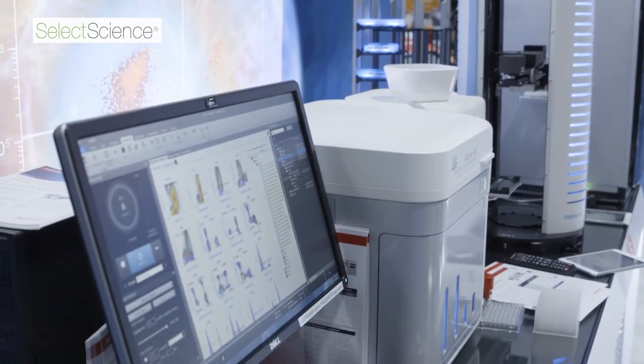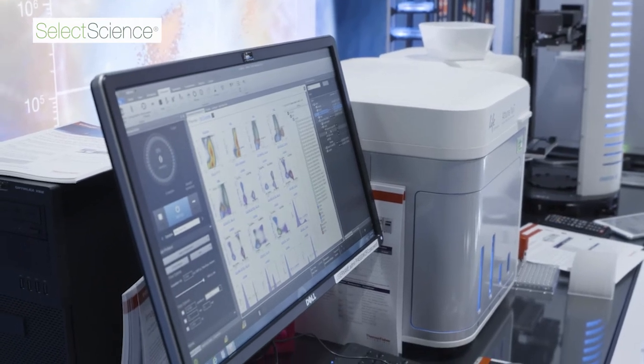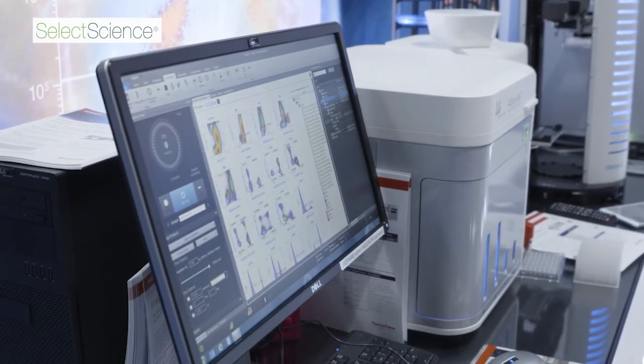The technology required to accelerate development of these sorts of tests will either be advances in flow cytometry, whether that is new detection methods or bespoke hardware for specifically testing in this manner, or moving into a microfluidic space that can be more readily field portable and grant access to those areas of the world that need it most.